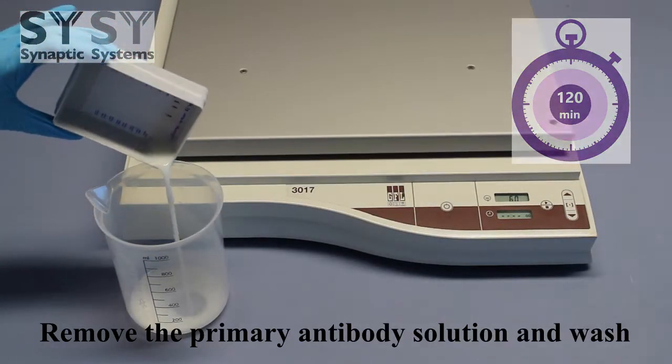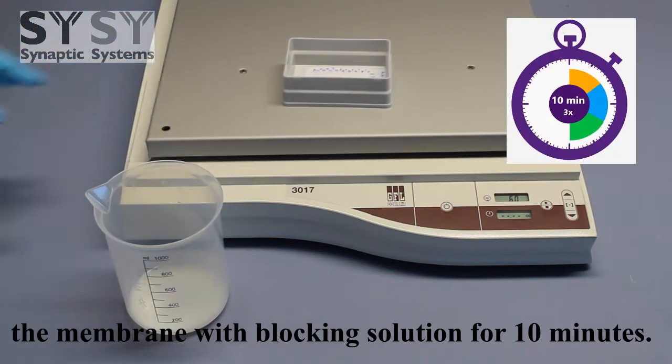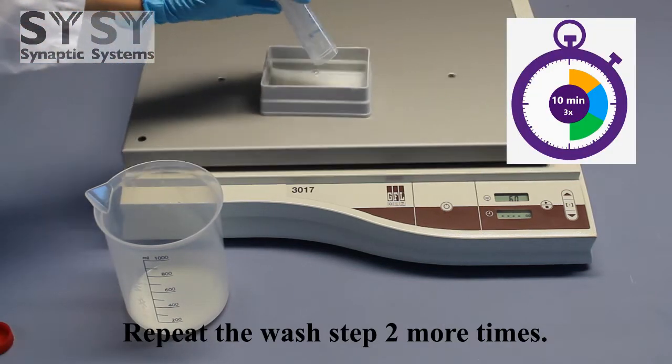Remove the primary antibody solution and wash the membrane with blocking solution for 10 minutes. Repeat the wash step 2 more times.